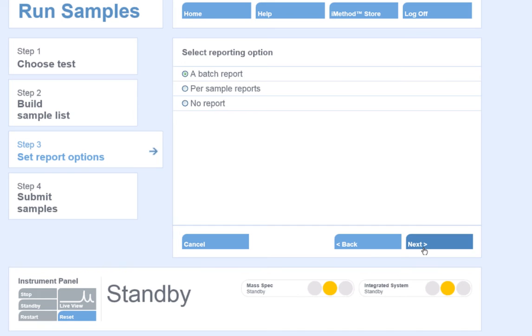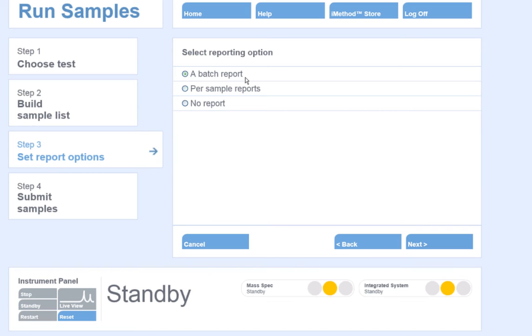My next option is reporting options for the output of quantitative data files. I have three choices for reporting. The first, a batch report, will automatically output my results after all of the samples in the list have been analyzed.